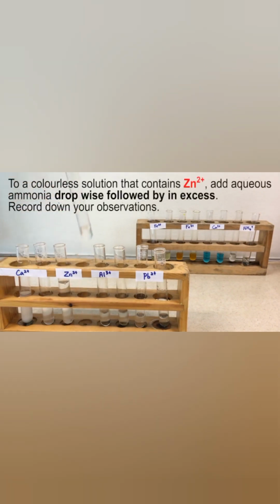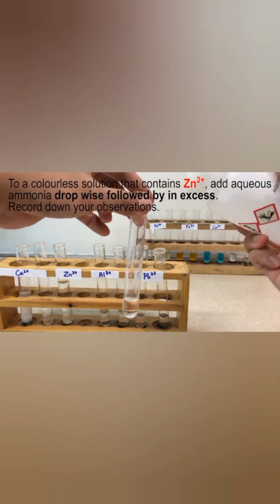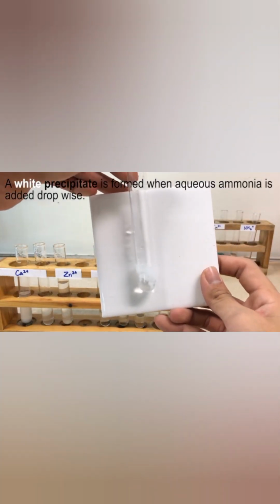Now let's go over to aqueous ammonia. To that solution containing zinc, let's add aqueous ammonia in drop. When added to a zinc-containing solution, a white precipitate is formed. If you check it, you see a white precipitate is formed.